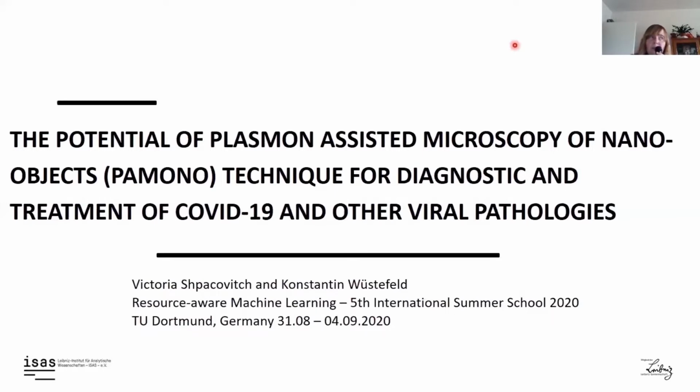Just let me introduce myself shortly. I'm a biologist and currently I work in the Leibniz Institute for Analytical Sciences, ISAS, with the PAMONO-sensor as a bioanalytical instrument.